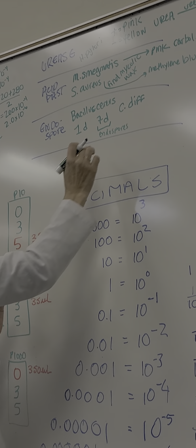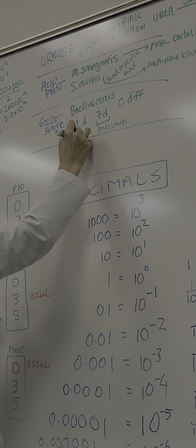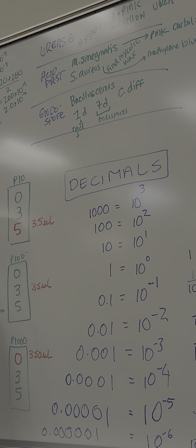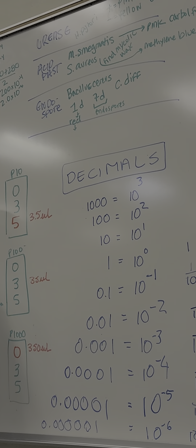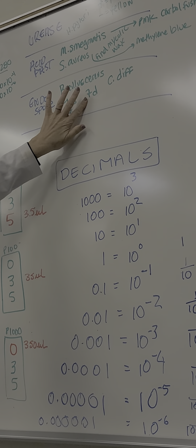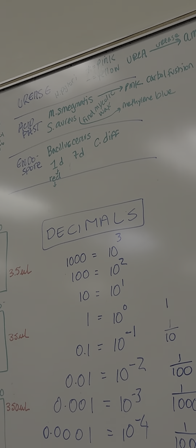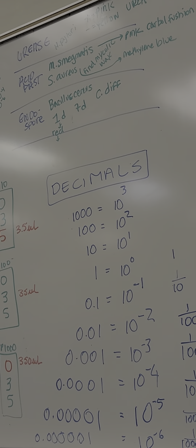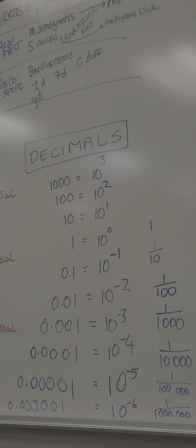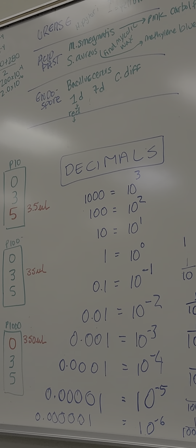What color are the one-dayers? Red because of what dye? What did we dye? No, this one. So remember, this is the one we boiled. We had to boil it because, so if you boil an endospore, does it kill the endospore? No. No, you have to autoclave it. So even though we did boil them on Bacillus cereus to try and get the dye in there, they still weren't dead. They still don't die because they can just sporulate.